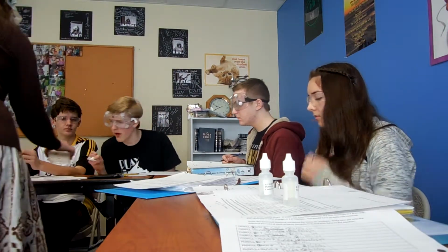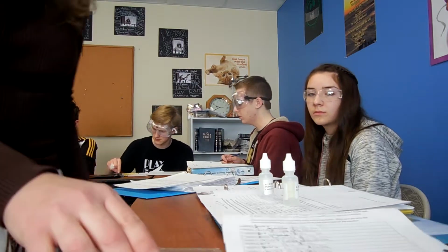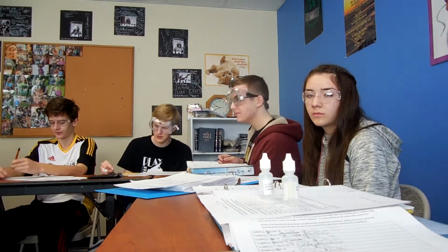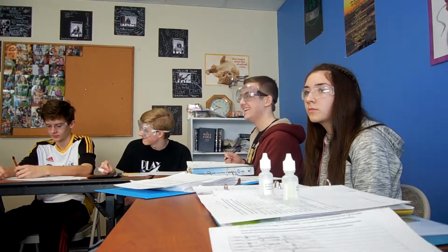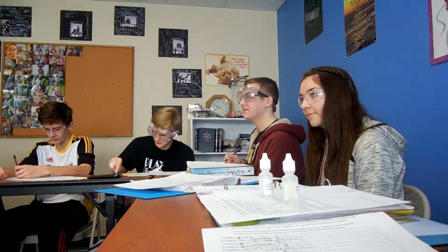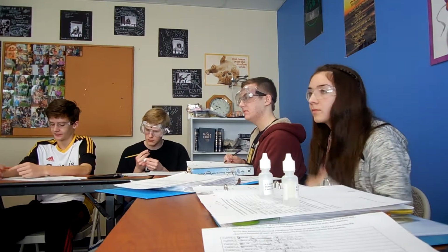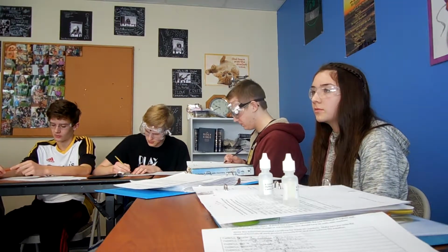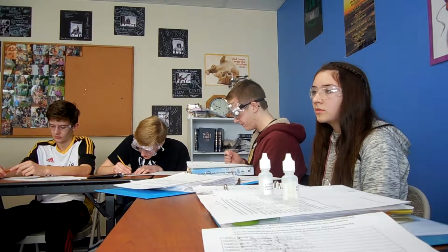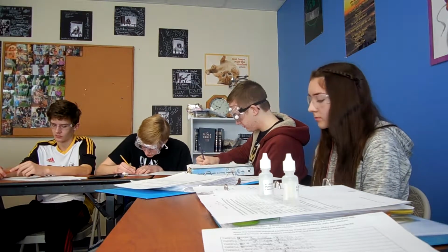So which thing is the yellow precipitate? We saw this at the beginning of the year. It is cool looking. You can see why lead paint was popular once upon a time because it makes such beautiful, vibrant colors. So, potassium nitrate or lead iodide as a precipitate? Lead iodide. We've already seen that potassium nitrate is soluble.